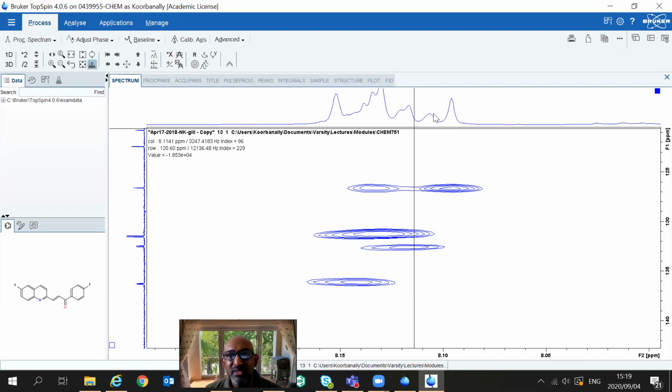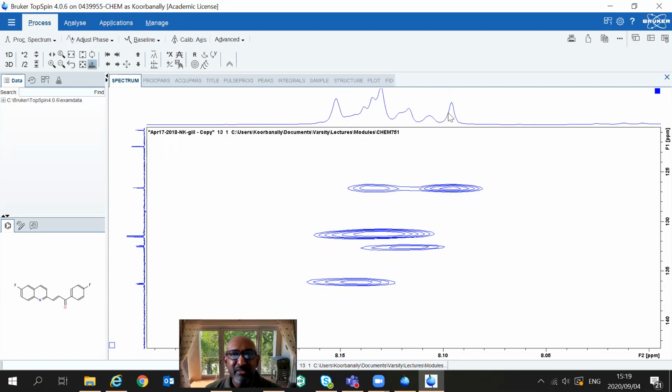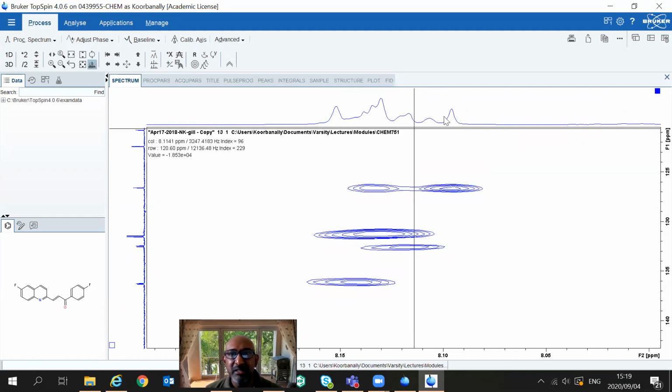So at certain times, what we can actually do is look at this particular resonance, and we can tease out the doublets and the double doublets in this mess, right? Which is a very intense thing to do when you're working out an NMR spectrum, to actually say that the double doublet is in this particular mess, and I know where the peaks are. I know that the peak is here and that the peak is here, right?